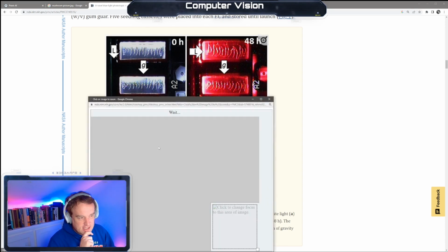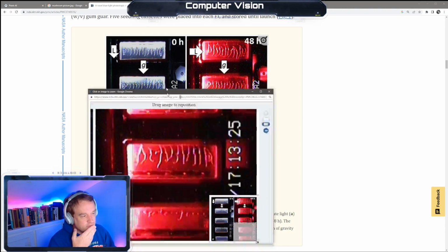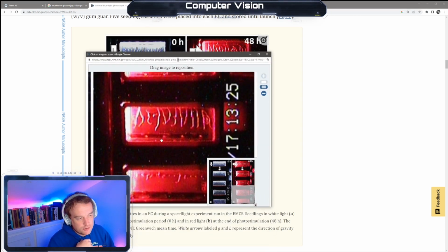And as you can see, their roots are growing in these different directions, right? Well, at the time when I did this, I wasn't quite the Python coder, and there are some additional issues I'll bring up throughout the course with this study, but I had to measure manually each angle of these root tips.